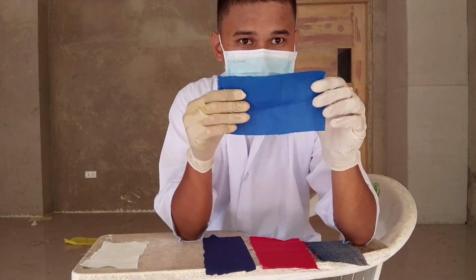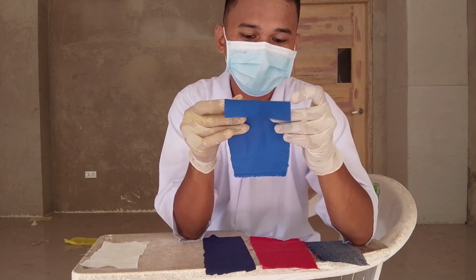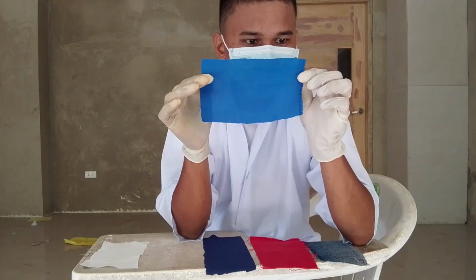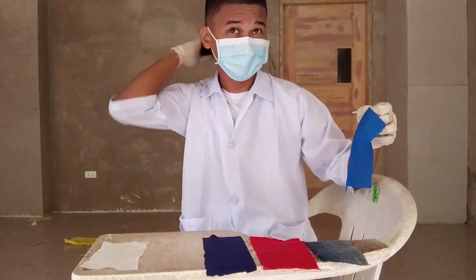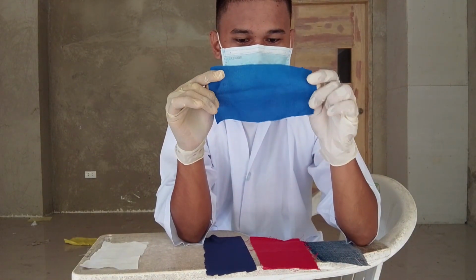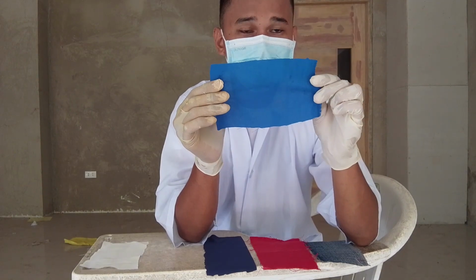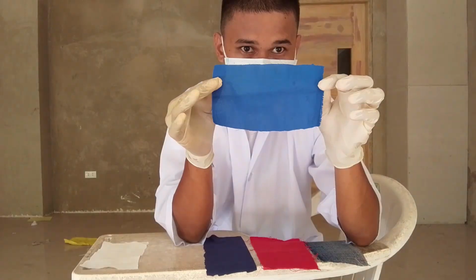Next is satin. Satin is commonly used as designs in the homes, like curtains and other things like signs, curtains. The texture of this satin fiber is soft, and also it is breathable fabric. And the shape of this is rectangle, and the size is 4 by 7 inches.